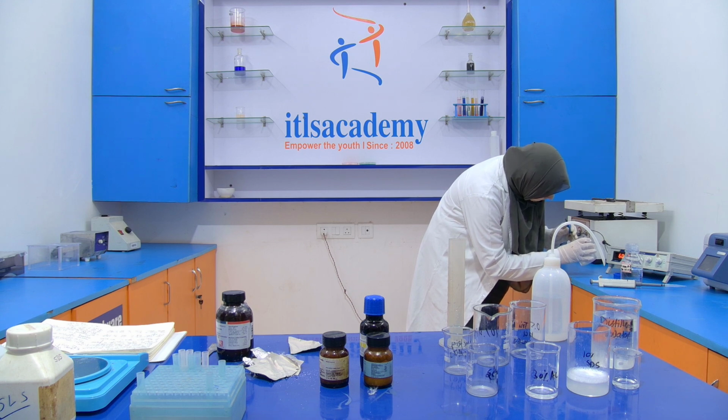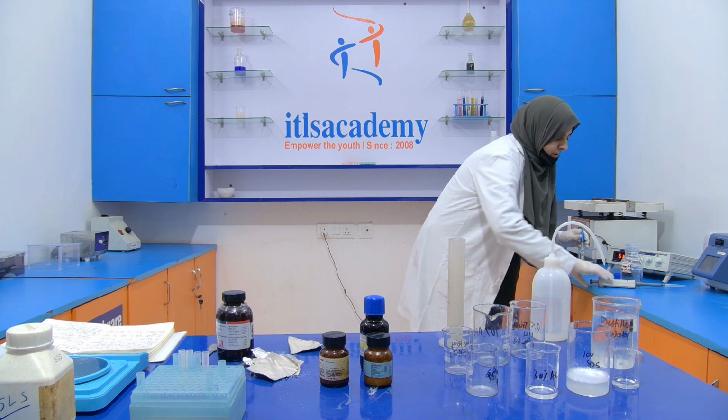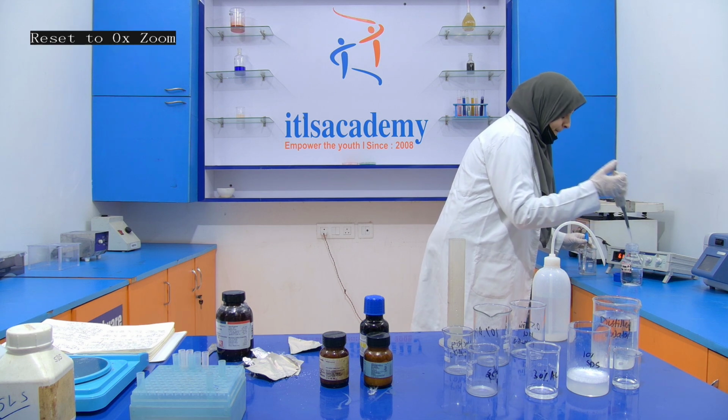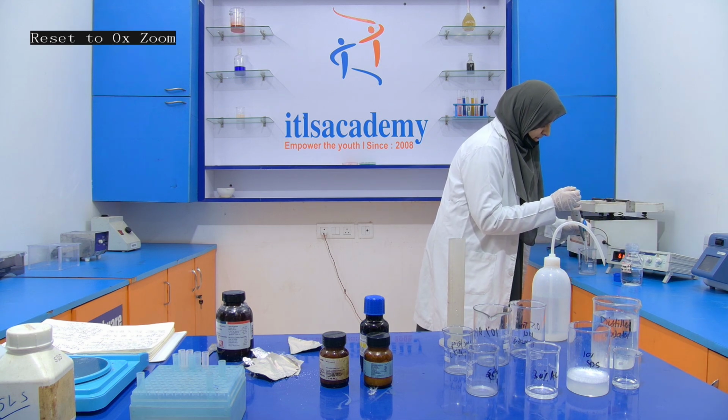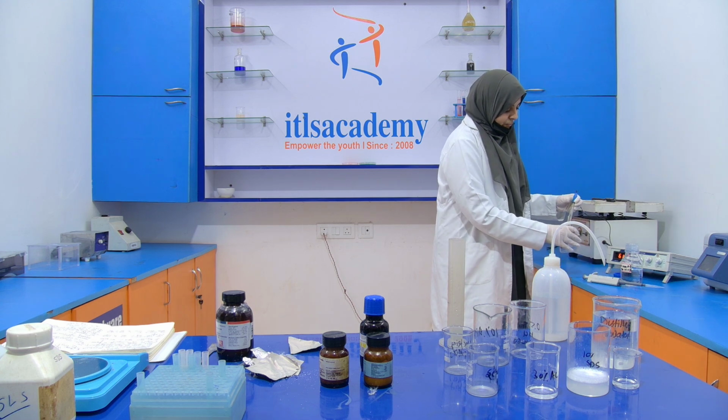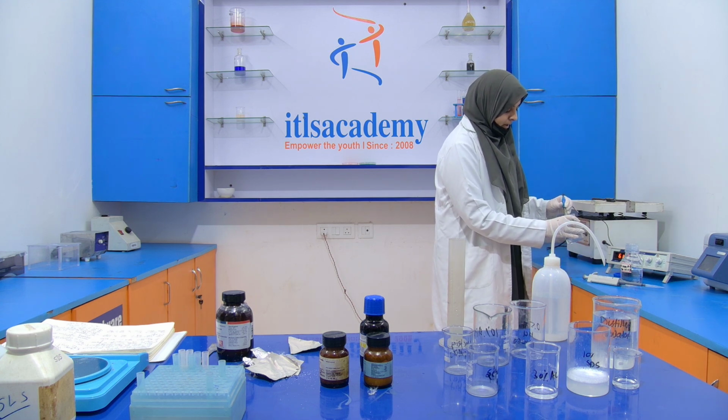You have to wait until it is stable, then the pH will be counted. So before taking the pH, one thing you have to do is the calibration of the pH meter. It is very important. How we calibrate the pH meter, the video related to this is already uploaded in our account.